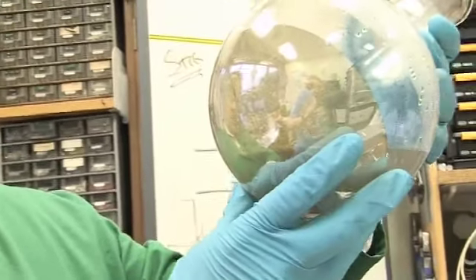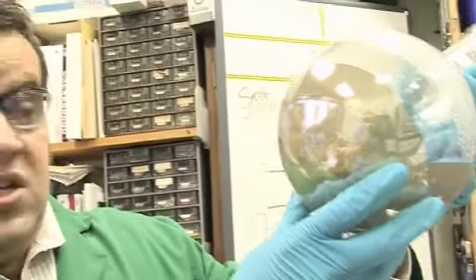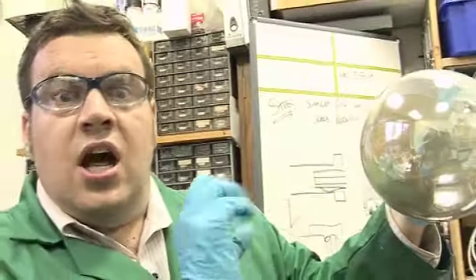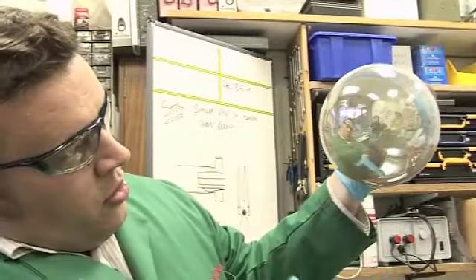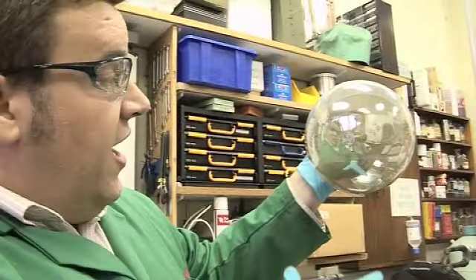So we've reduced the silver from the salt, the diamine complex, to silver zero or metallic silver, which has then precipitated and covered the glass. Perfect mirror that we formed on the inside of this flask.